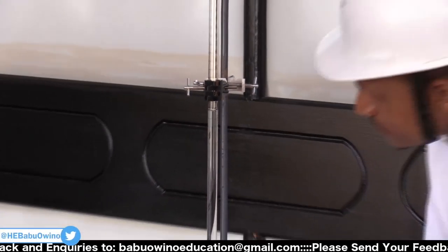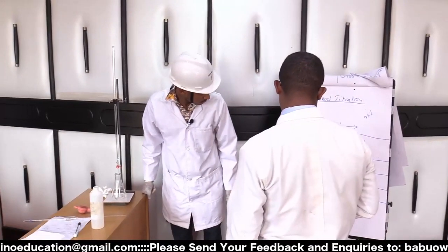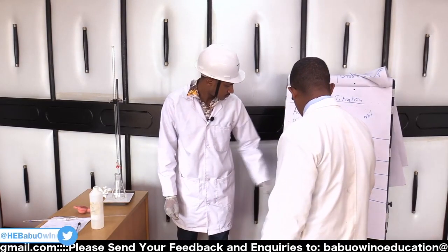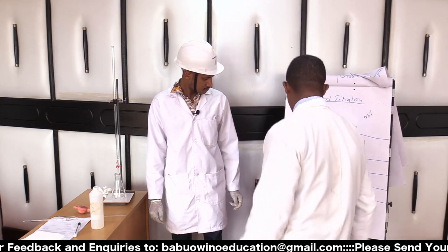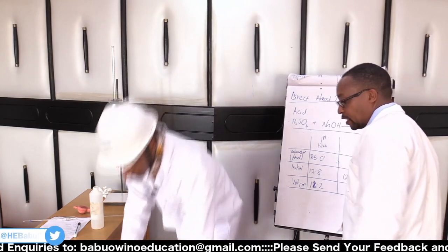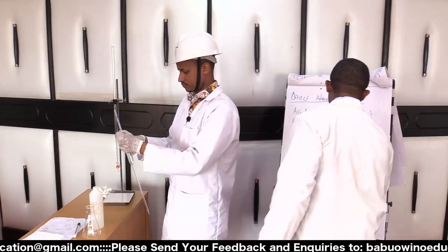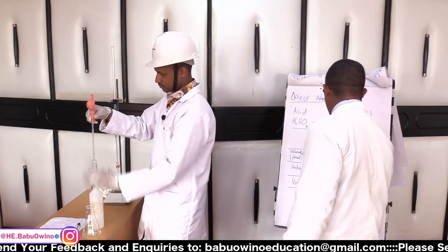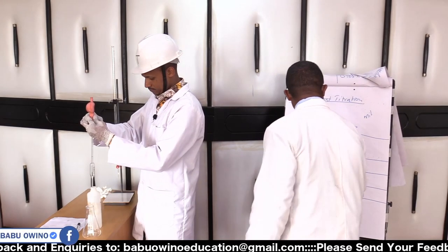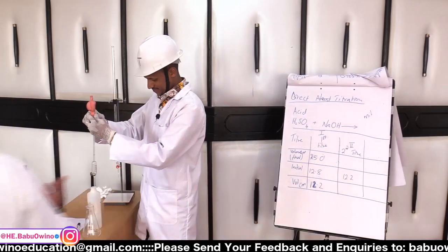25.0. So that gives me 12.2, correct. So we can start with the same 12.2 as our initial. Don't release it. We suck again. So this is our second titer, titer number 2. Or you can simply call it second titer. This is the first titer. These are the titers. And therefore, this is titration. And this is volumetric. Big name to scare you, but little stuff.